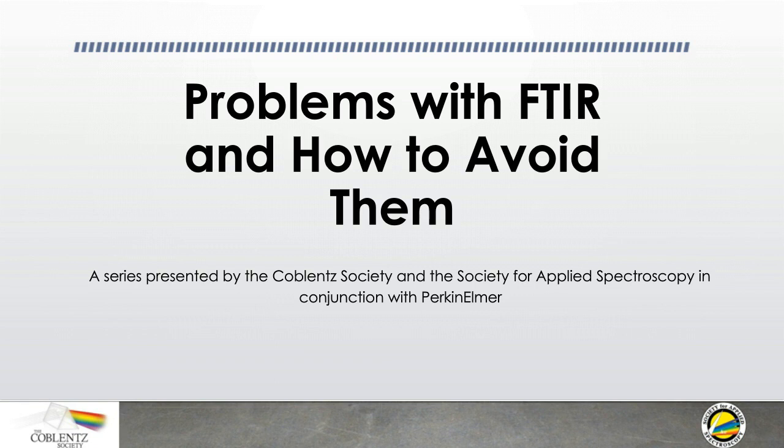For our talk today, we'll specifically draw attention to FTIR instrument problems that show up in the IR spectrum. This talk will focus on instrument issues and how to quickly determine if the instrument might have a problem or show up an artifact and how to optimize the collection to obtain best quality data.